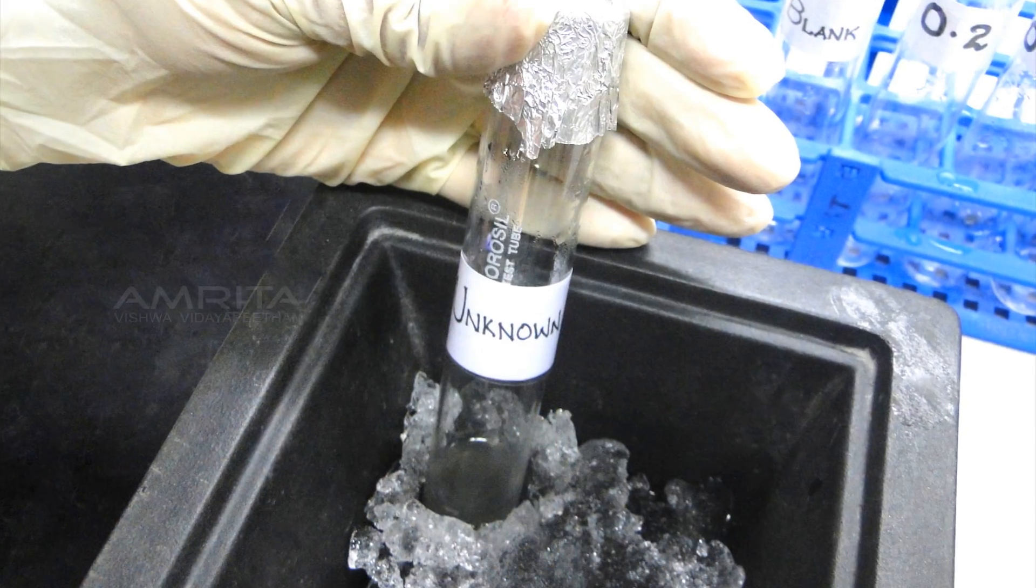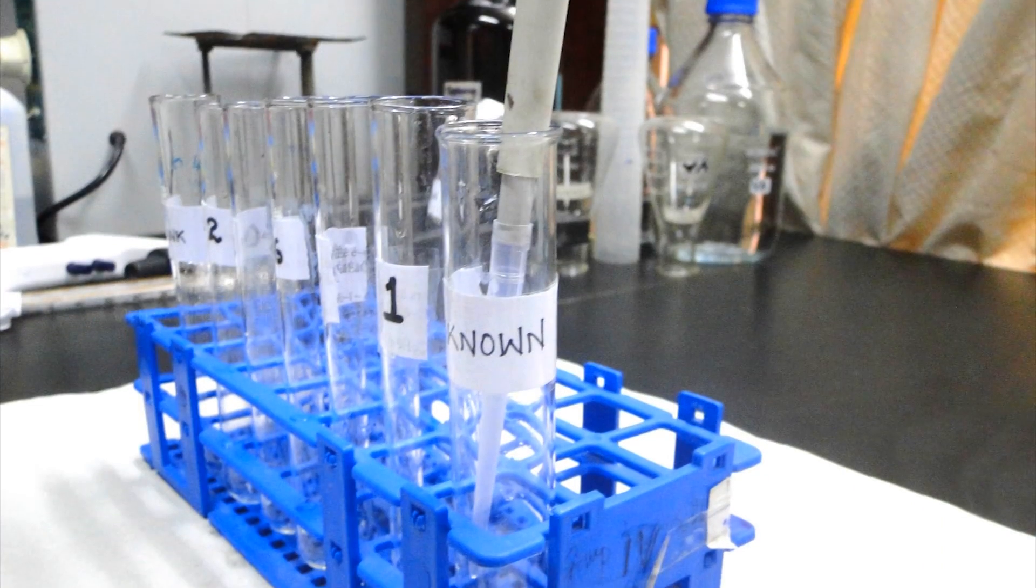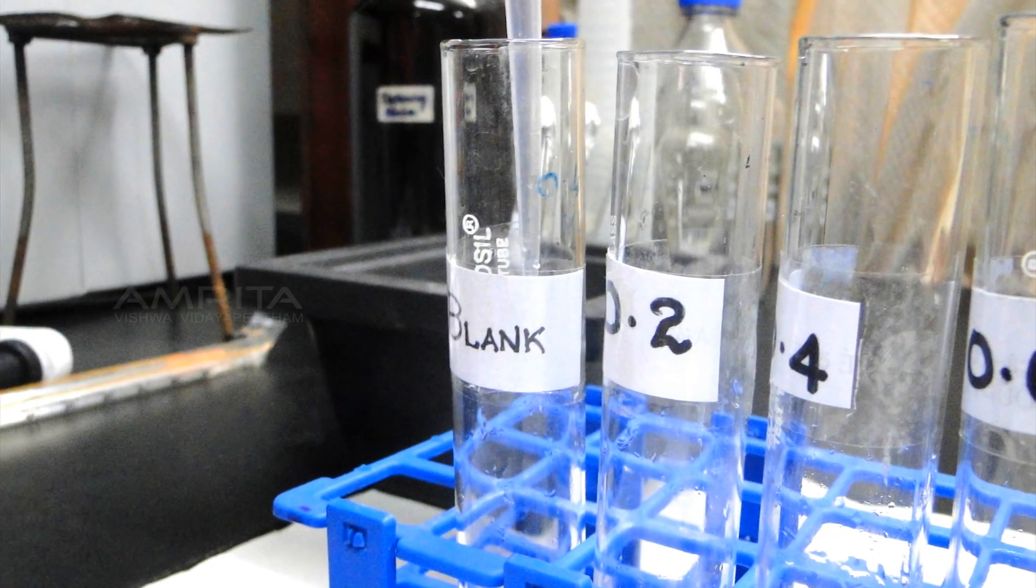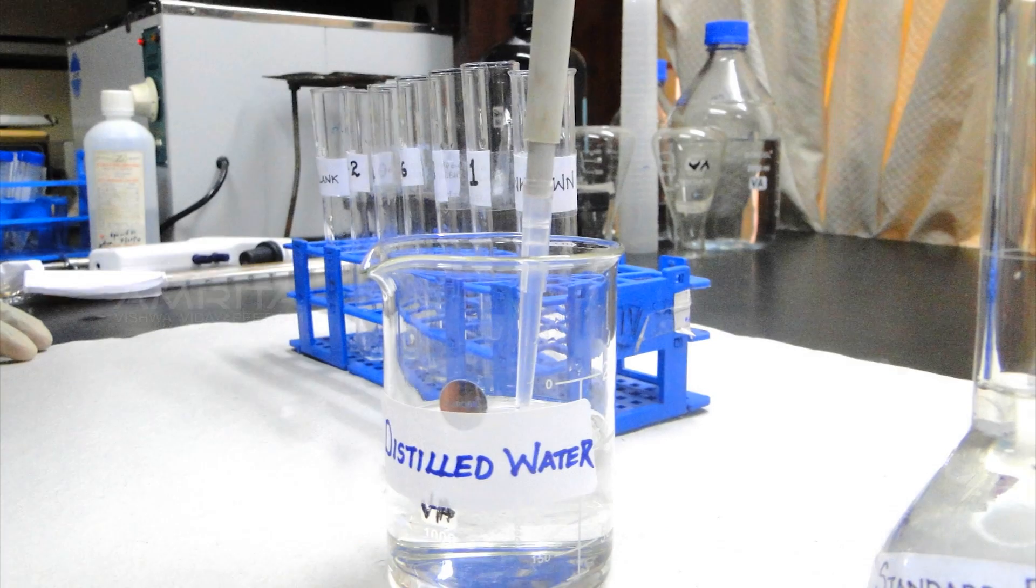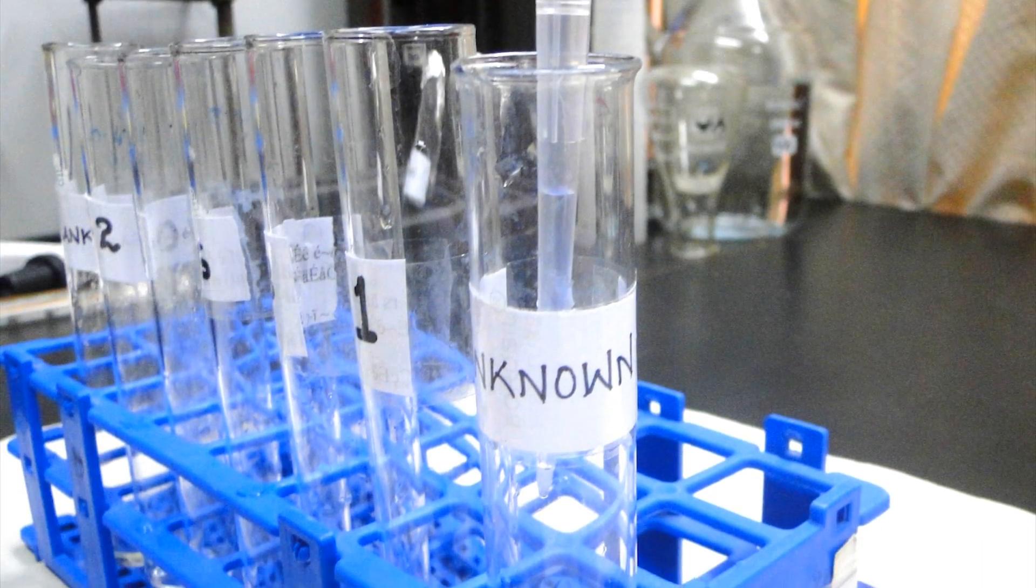Pipette a known volume of the unknown solution to the tube labeled unknown arranged in the test tube rack. To the test tube labeled blank, add 1ml of distilled water using a micropipette. Volume in each test tube is made up to 1ml by adding distilled water.